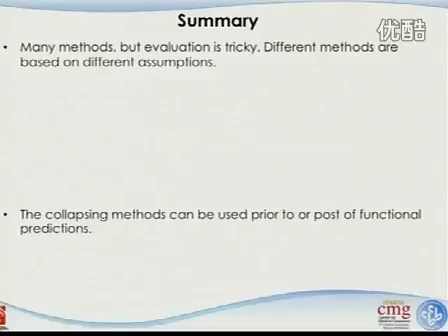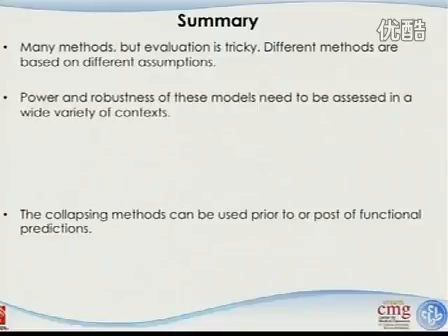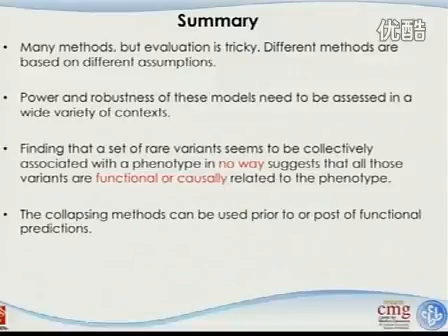But without real data, people do a lot of simulation, and of course the way they do the simulation will follow the assumption that their method is based on, so their method always performs better than everybody else. That makes the evaluation really, really tricky. The power and the robustness of these models need to be assessed in a wide variety of contexts, so we don't really know much about the performance of different approaches.